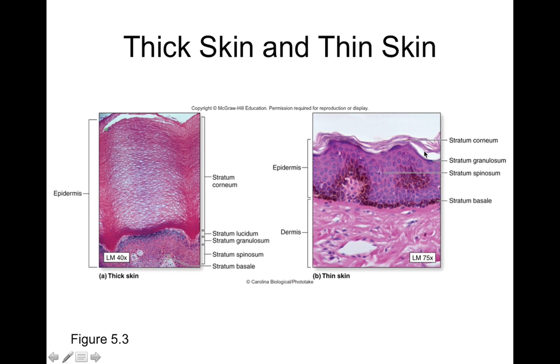Attachment. Yeah, you got it. The stratum corneum is kind of being pulled away. It's just how the tissue was prepared. So when they cut this tissue, the stratum corneum kind of tore away from the granulosum, but they should be attached. So you can kind of see a nice thin layer of granulosum. You got stratum spinosum and then stratum basale.